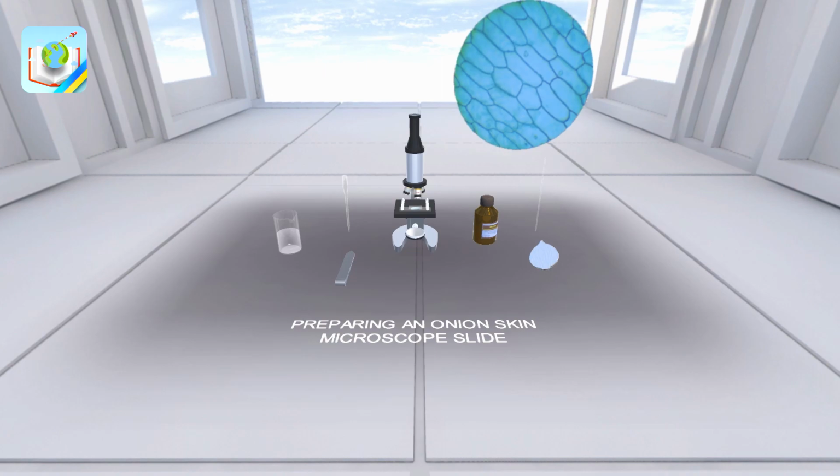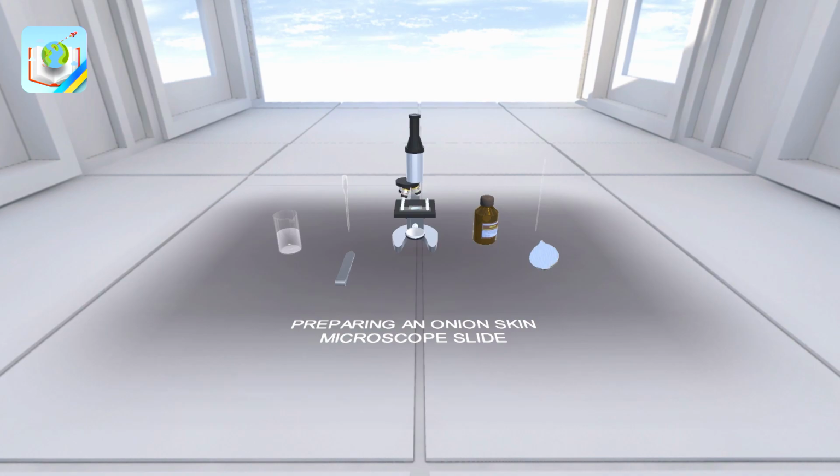Now, let's adjust the microscope for high magnification. We turn on the lens, set the sharpness, brightness, and contrast. We now observe the nucleus, indicated by a red arrow, and thin strands of cytoplasm that penetrate the vacuole, indicated by black arrows.